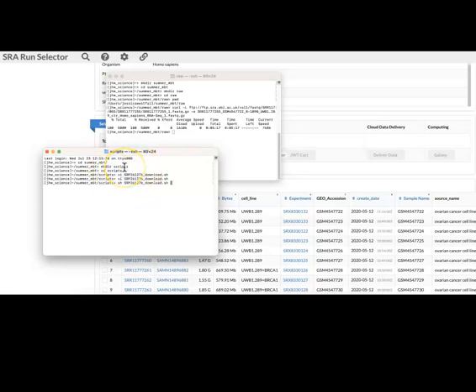So if I want to have it run and point the download file to the other directory, my raw directory, I'm going to have to add a little bit more to the shell script, which I'm not going to do at this time. If you are interested in that, you can let me know, and I can show you how to go about that. But just be aware that because I'll be running this shell script in the script directory, this is where the files will be downloaded to.